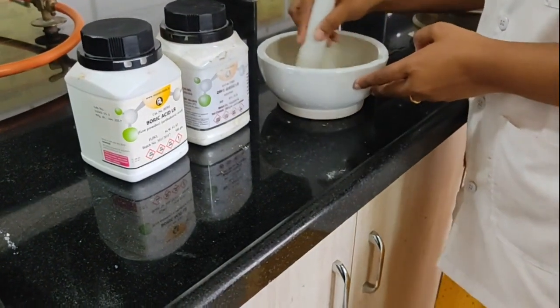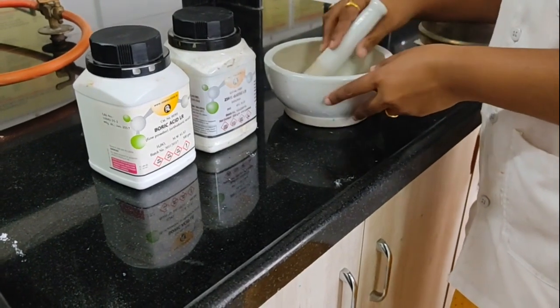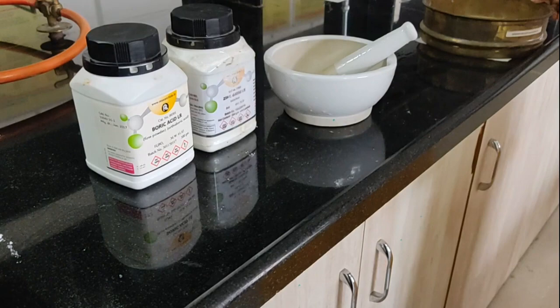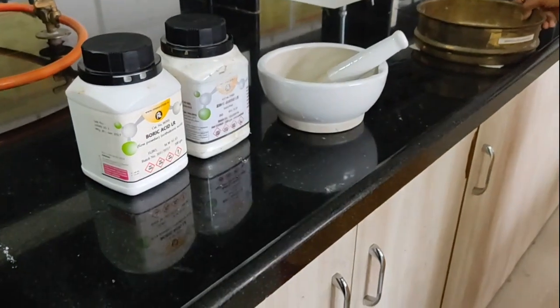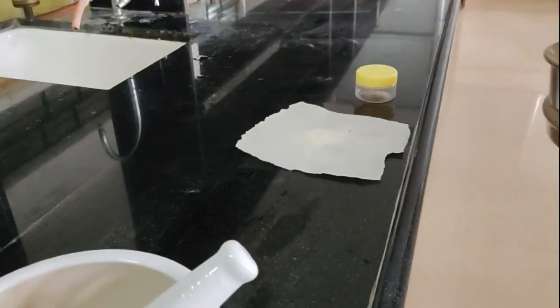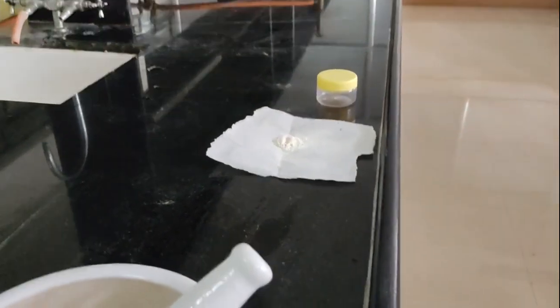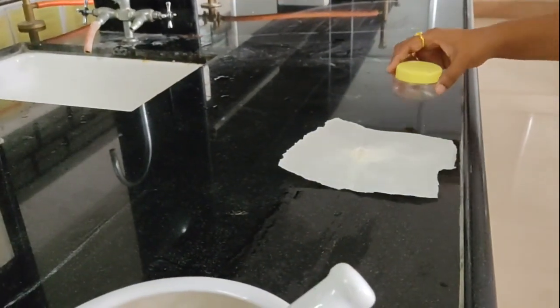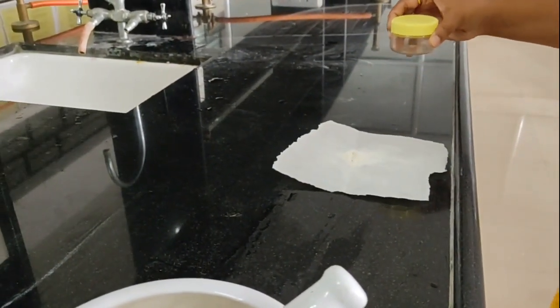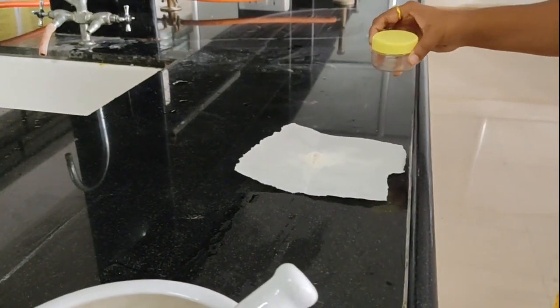After proper mixing of this powder, now I am going to transfer this powder through this sieve number 80. I transferred this powder through the sieve onto this paper, and after that I am going to fill it into this wide mouth bottle, and then we will proceed to the labeling part.